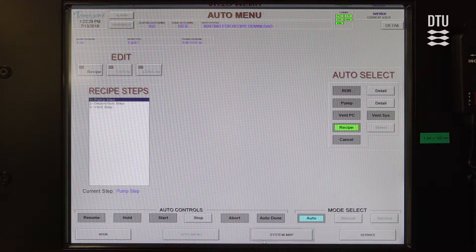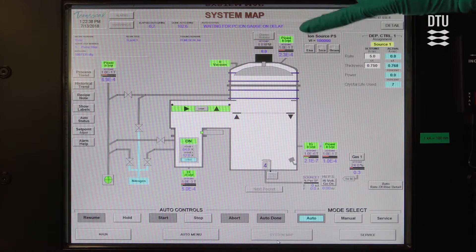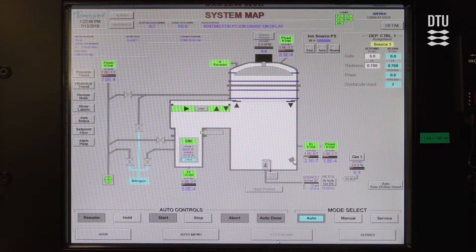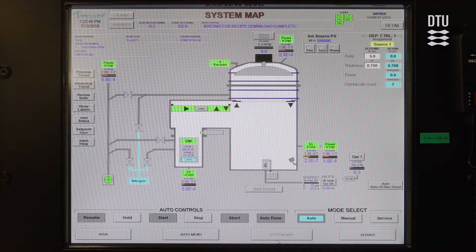And then we can go back to the system map and see what happens and follow the process. So at the top of the screen, in the auto status, you can see what the system is doing. And right now it is downloading the recipe.